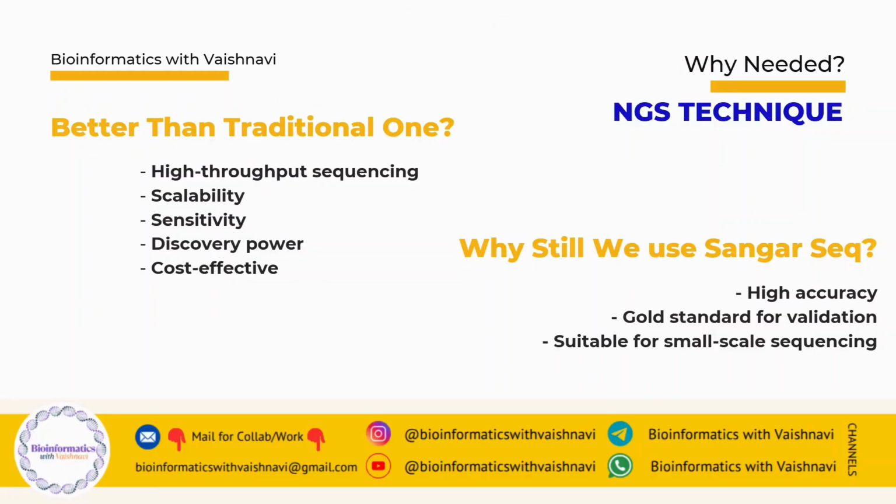Okay, now we will see why NGS is better than Sanger. Compared to Sanger sequencing, NGS offers many advantages. NGS can sequence millions of fragments at the same time, which makes it high throughput, right? It is scalable, more sensitive, has higher discovery power, and becomes cost effective when large datasets are analyzed. That is why NGS is preferred for large scale studies.